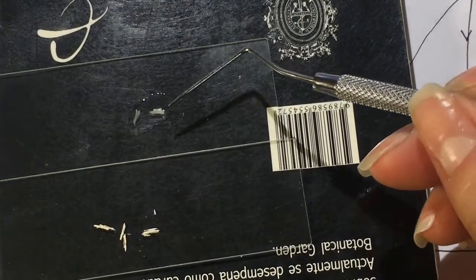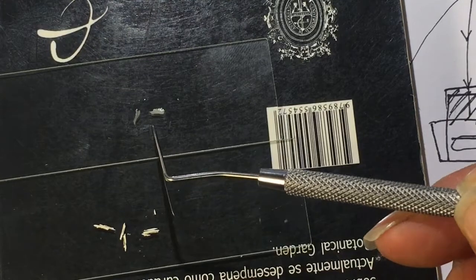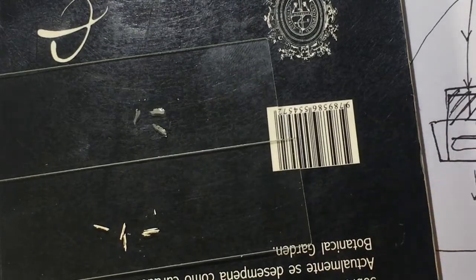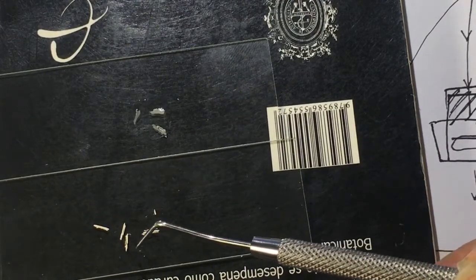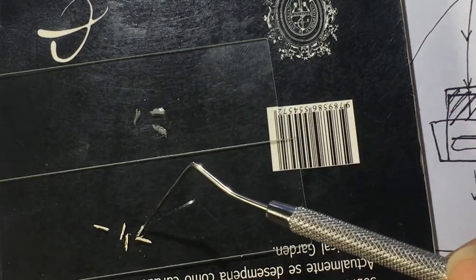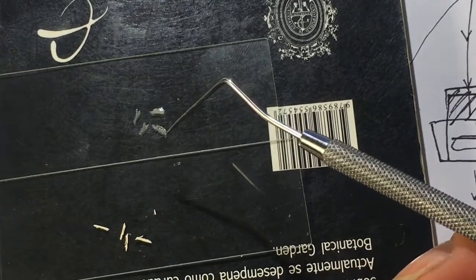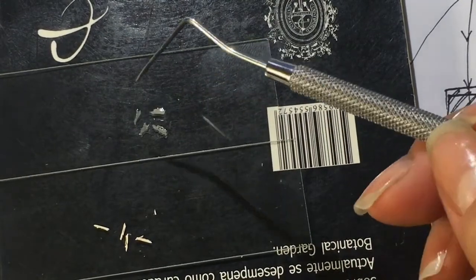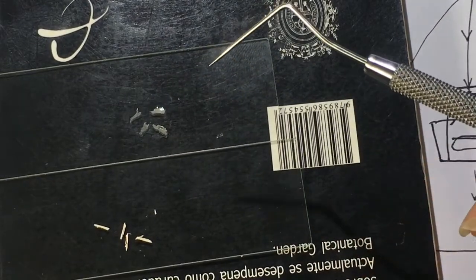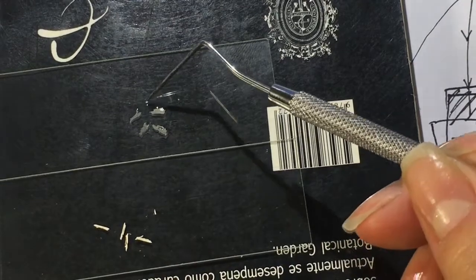So if we had not removed the context as much as we did, we would have a piece that was much larger here. So what I'm doing is I'm trying to grab what I think are my thinnest, but you never know. Sometimes a thick section may be actually two good ones stuck together. Now, the way that I'm placing it on the alcohol here, I'm losing orientation. But usually when working with a wart or universal veil in Amanita, once you see the cellular structures that form your tissue, it's very easy to know what part you're looking at. You won't be lost.